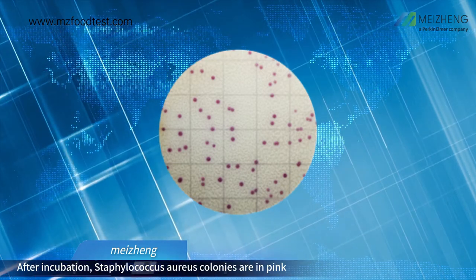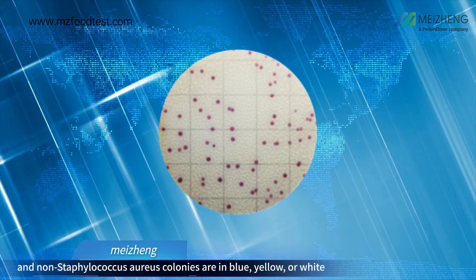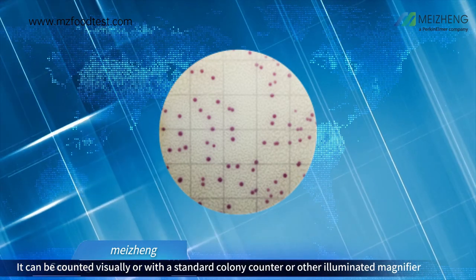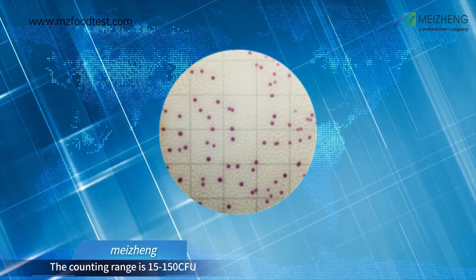Interpretation of SA count plate: After incubation, Staphylococcus aureus colonies are in pink, and non-Staphylococcus aureus colonies are in blue, yellow, or white. It can be counted visually, or with a standard colony counter, or other illuminated magnifier. The counting range is 15 to 150 CFU.